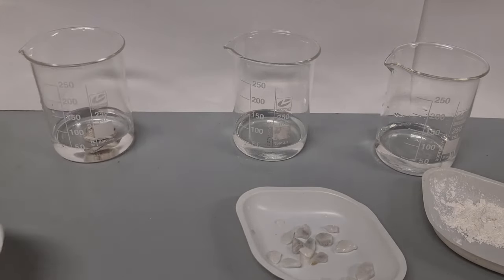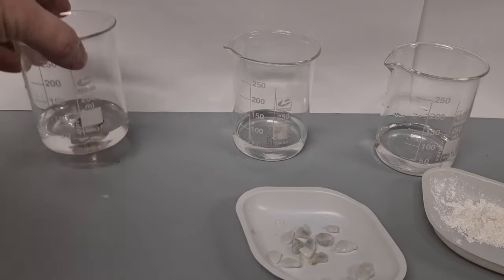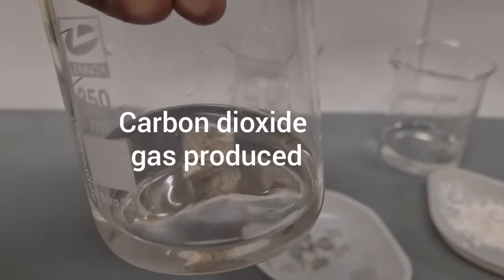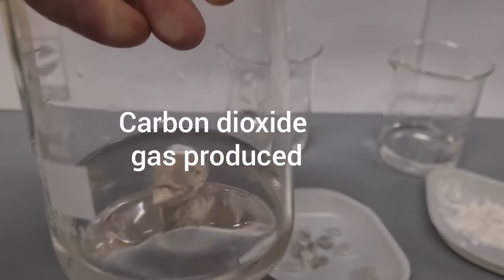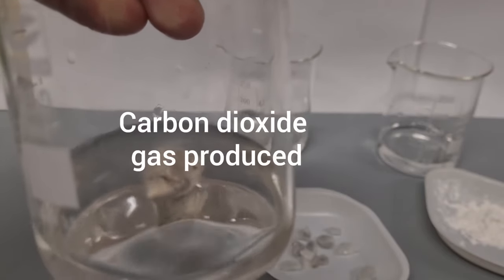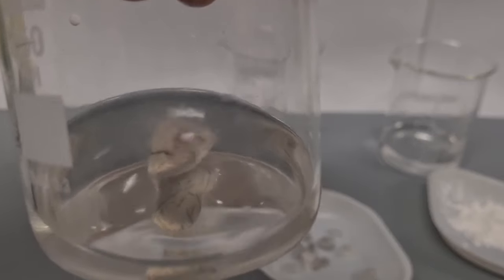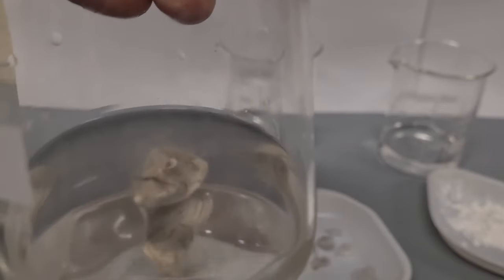So when I put in the big piece of calcium carbonate, we can see fizzing, so a chemical reaction is happening. Bubbles of carbon dioxide gas are being produced. This is a slow chemical reaction.